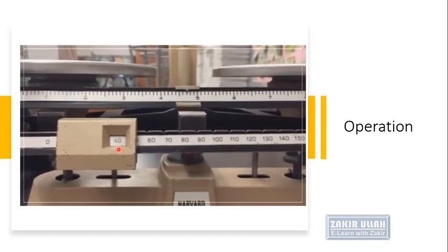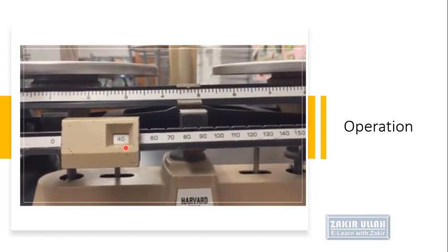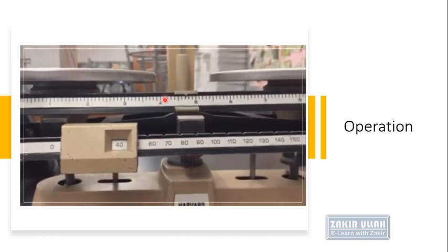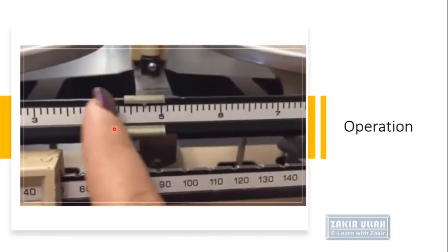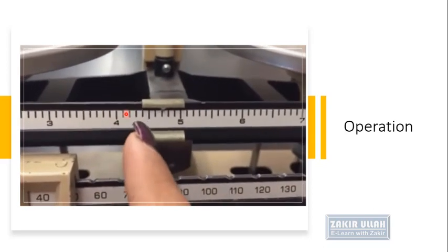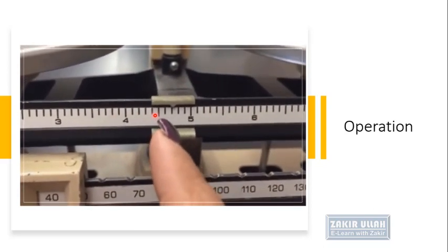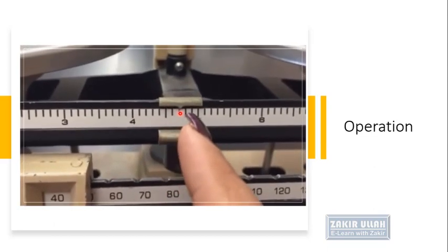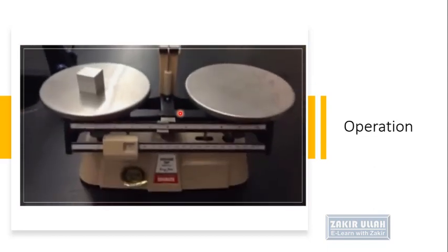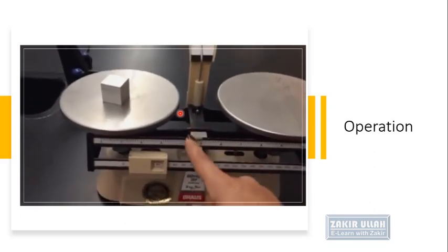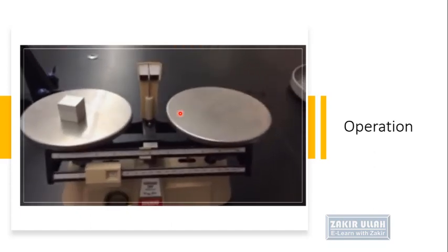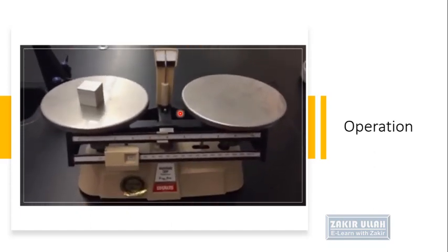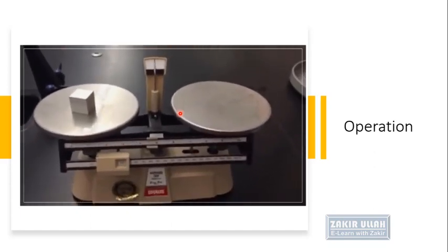This is how a trip balance is used in the laboratory. For example, the reading shows 40 on the lower beam, and on the upper side we can read 44.1, 44.2, 44.3, 44.4, 44.5, 44.6, and 44.7, showing that this object has a weight of 44.7 grams. This is how we measure any object's weight with the help of a trip balance.